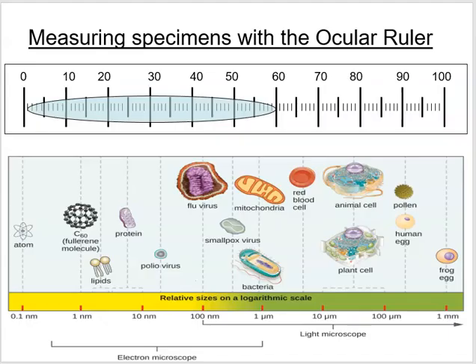So there's a lot going on with this, and in lab you're going to be taking some prepared specimen and doing what I've done in these last few parts of this video here. You're going to be measuring single isolated cells at different magnifications, say 4x and 10x, and then determining the size, and the numbers should be relatively close to each other.